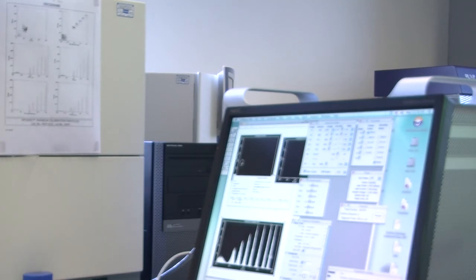So don't take anything out at the moment. Add 1 milliliter to each one of the tubes, and change the tips every time for different quantities. After adding that, we can transfer the tubes into the centrifuge.